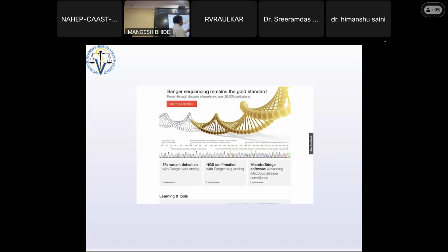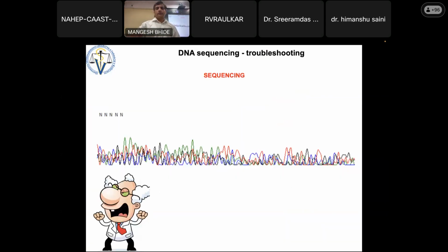And then we need to have some microbiome work and all this. So after microbiome analysis, you have to go back and sequence on the Sanger. So Sanger sequencing still remains a basic tool for confirmation of all nucleotide identifications. Have you seen the electropherogram, or chromatogram, as we say? So this is the baddest chromatogram ever you can see.